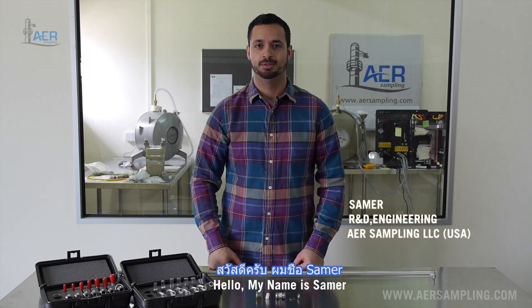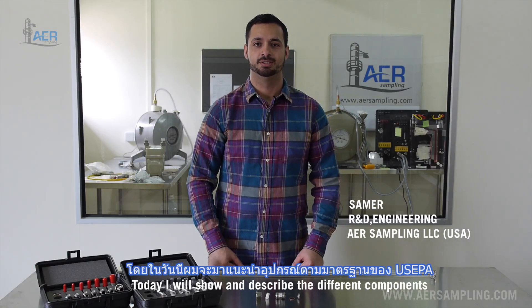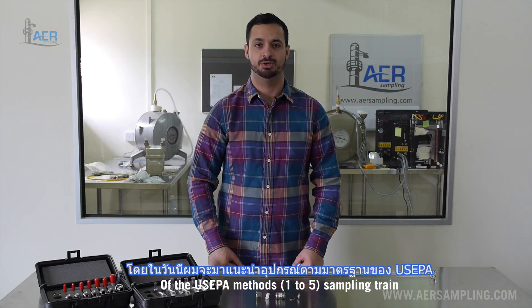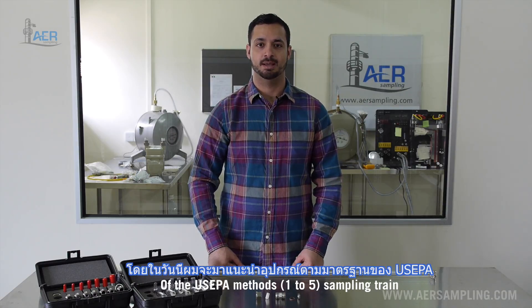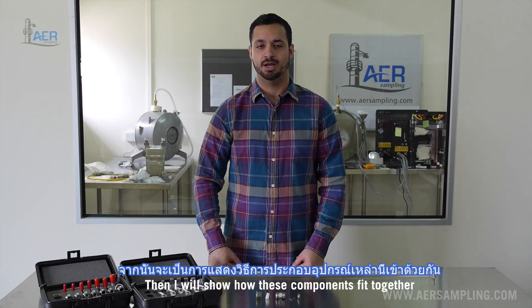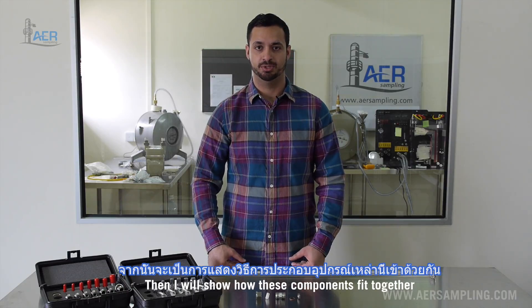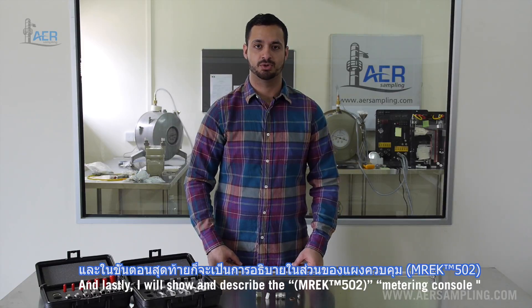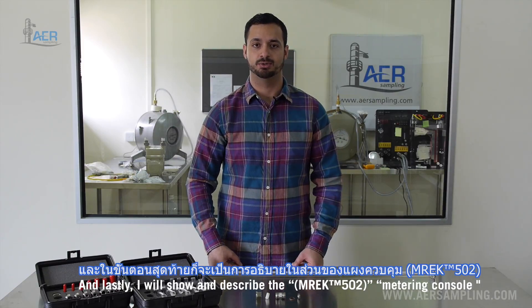Hello, my name is Samer. This is the AER Sampling basic training video. Today I will show and describe the different components of the US EPA method sampling training. Then I will show how these different components fit together, and lastly I will show and describe the metering console.